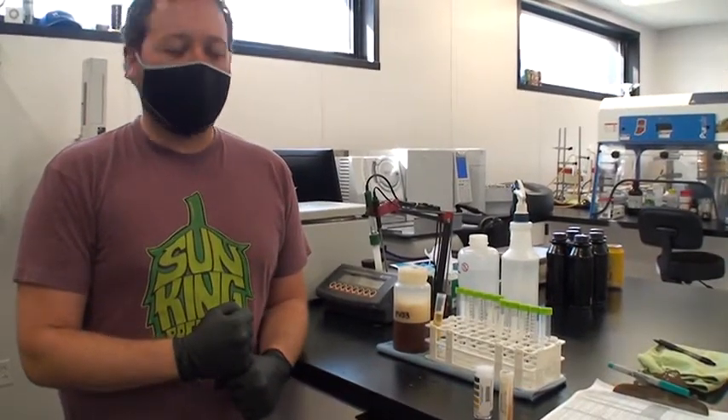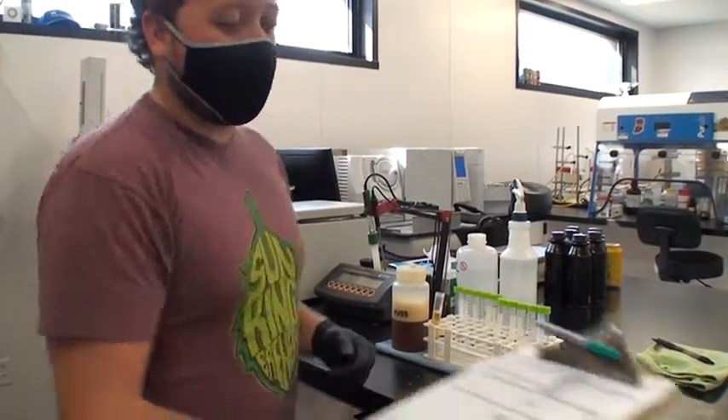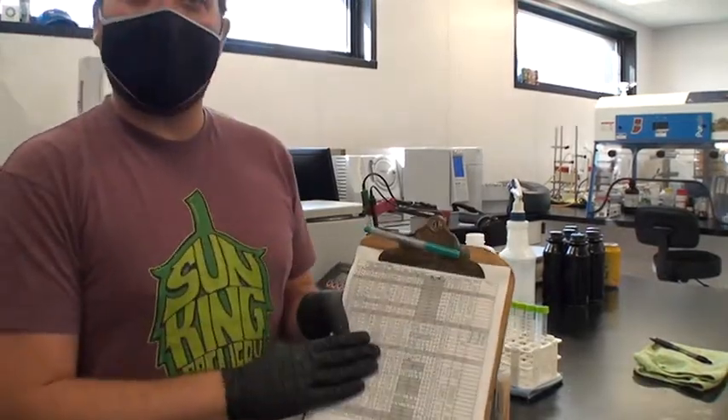One of our most important daily quality control checks we do is what we call our cellar report, where we walk around our entire brewery and get information about every fermenting beer, every bright tank, everything that we need to check to make sure there's not going to be any problems. It's done daily on every beer, every single day.